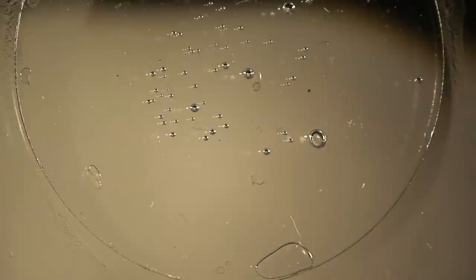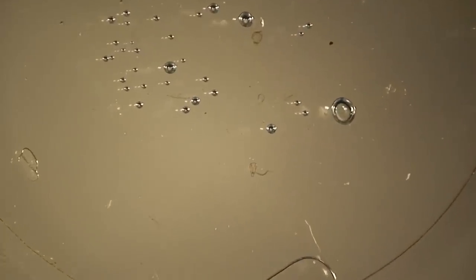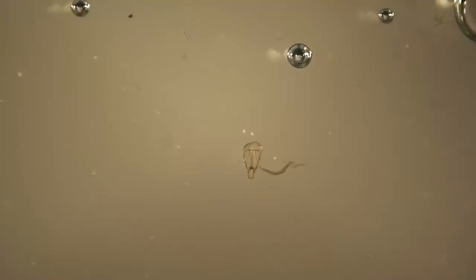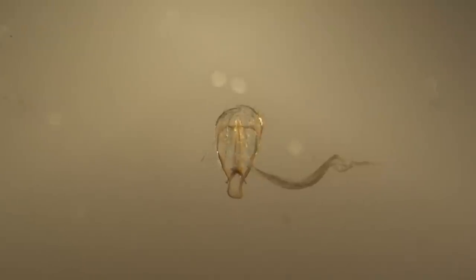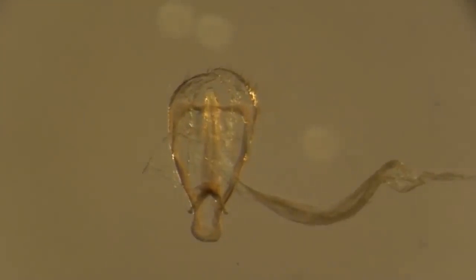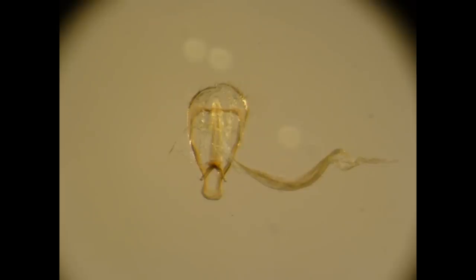After it has been orientated correctly, a cover slip is placed over the medium. Here, we have used glycerol as a short-term mountant. The aedeagus is now ready for examining. From the female genitalia, we have mounted, in a similar fashion, the sclerites in the bursa copulatrix. These are more robust and less prone to breakage.